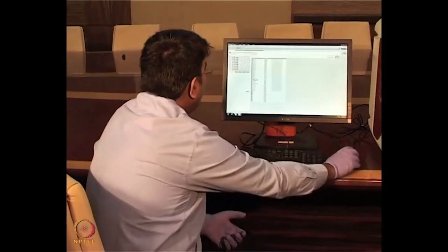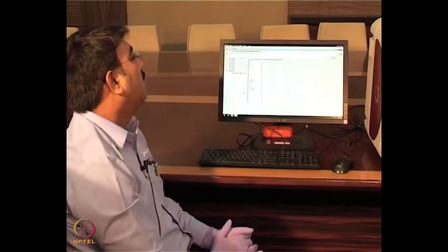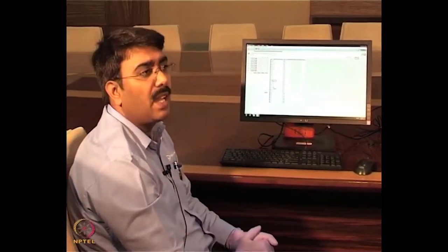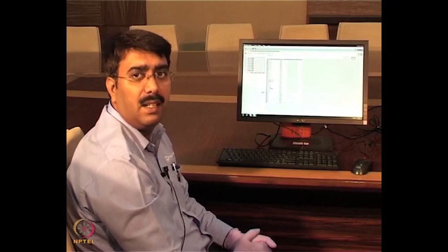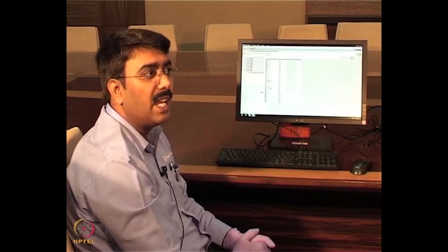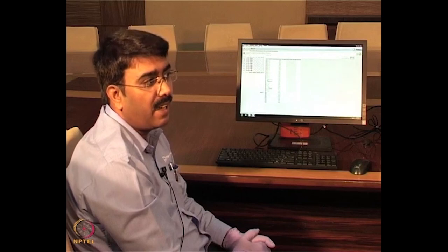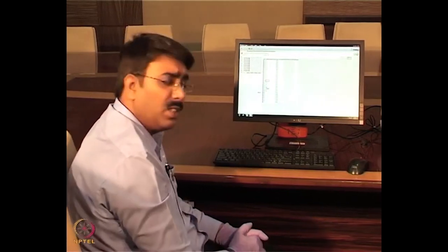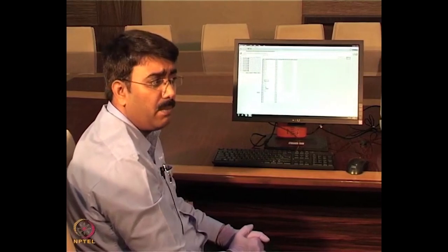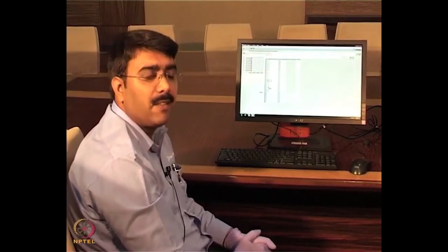Here, as I mentioned, we can use any kind of buffer. Now in this experiment I am using a PBS buffer with additives: 0.1% BSA, as well as a surfactant, 0.02% Tween 20. So this composition is in PBS at pH 7.2.